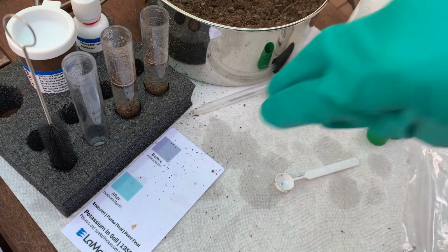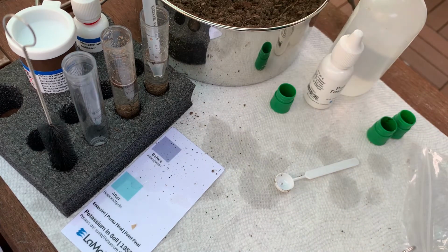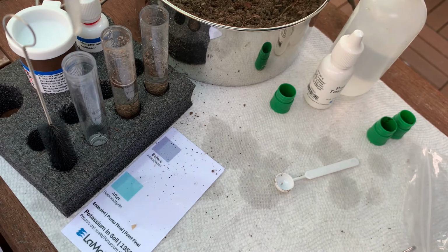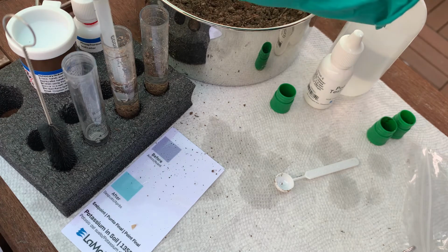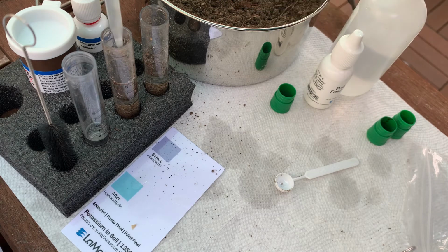Using a clean pipette, we want to transfer the clear liquid to a 3rd test tube, a clean test tube that hasn't been used yet. Be careful not to pull up any soil. And we're trying to get this test tube up to line 5. Which is why I recommend doing this with 2 test tubes to begin with, so that you have enough liquid to get yourself up to line 5.